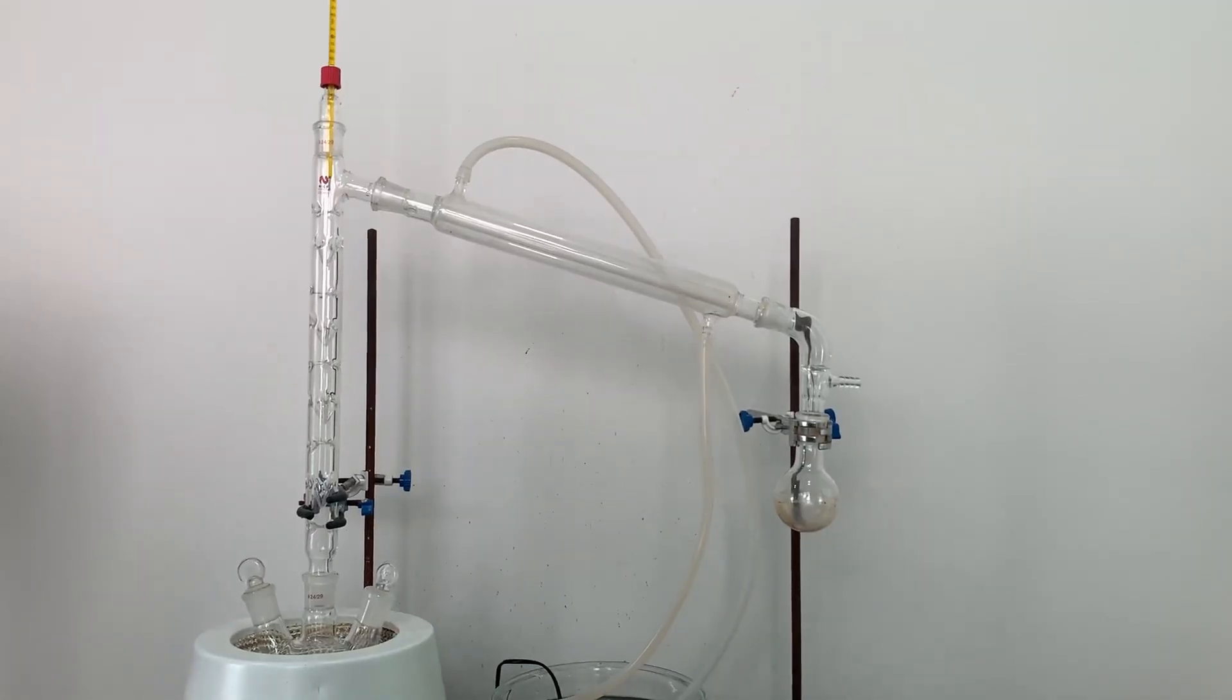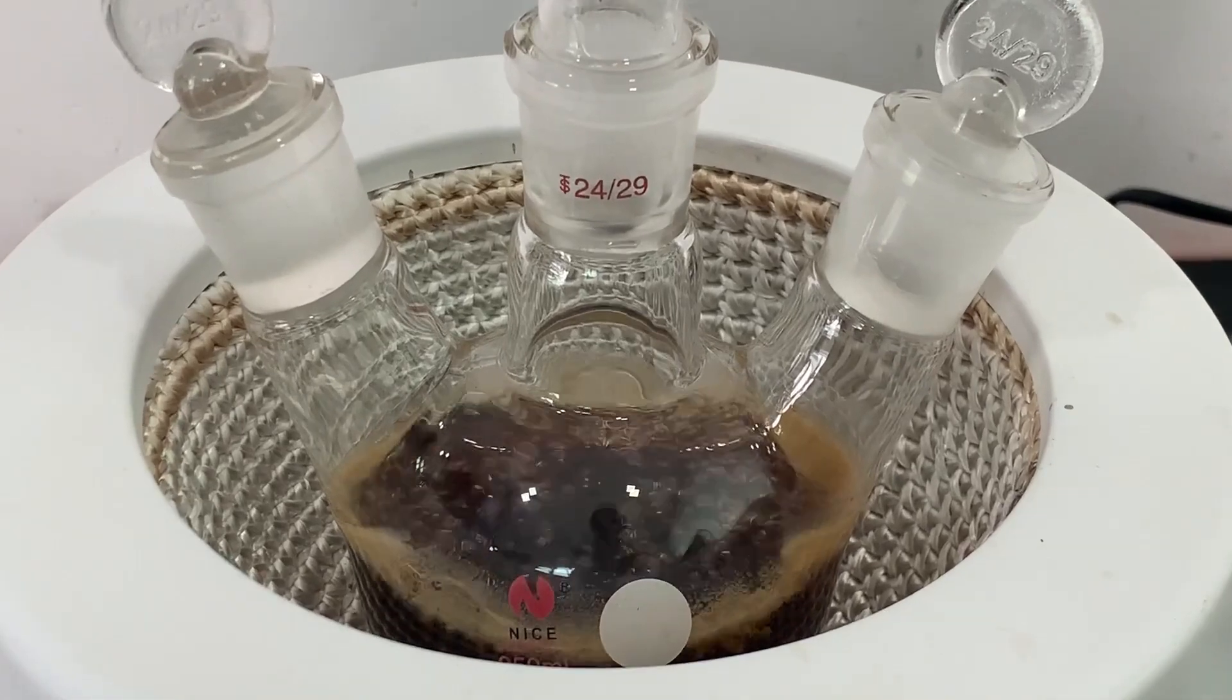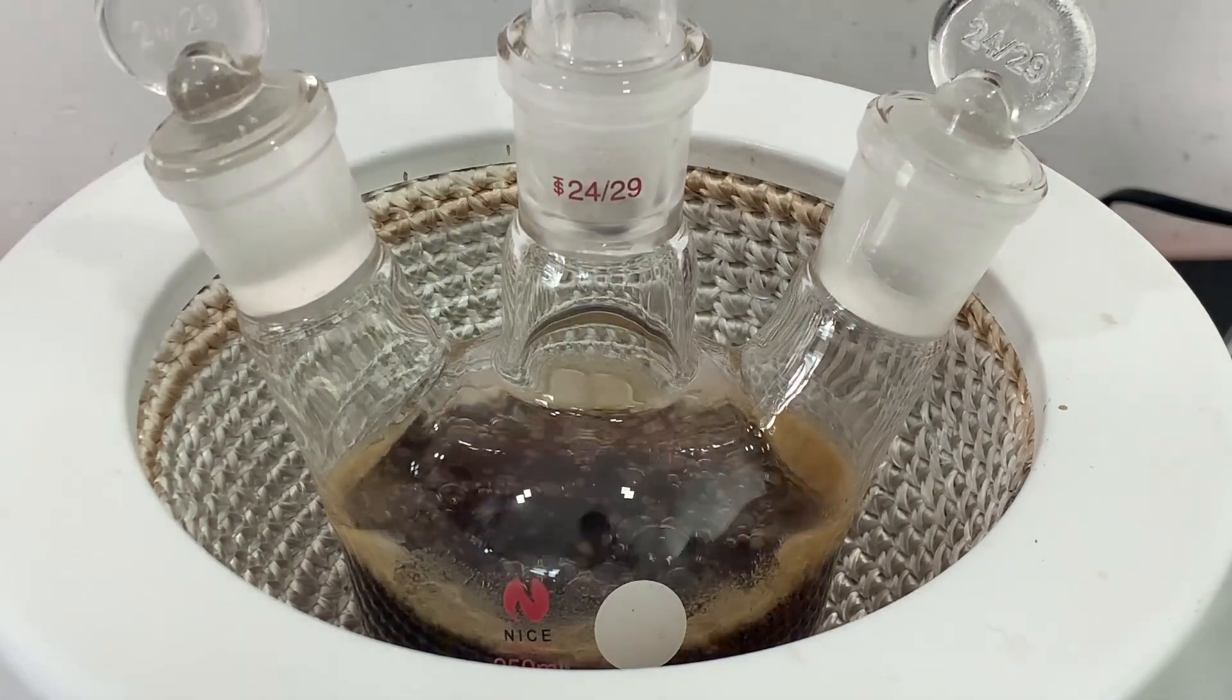A fractional distillation set is then set up. The flask is heated and the cyclopentanone started to boil and vapors traveled up the fractionating column.